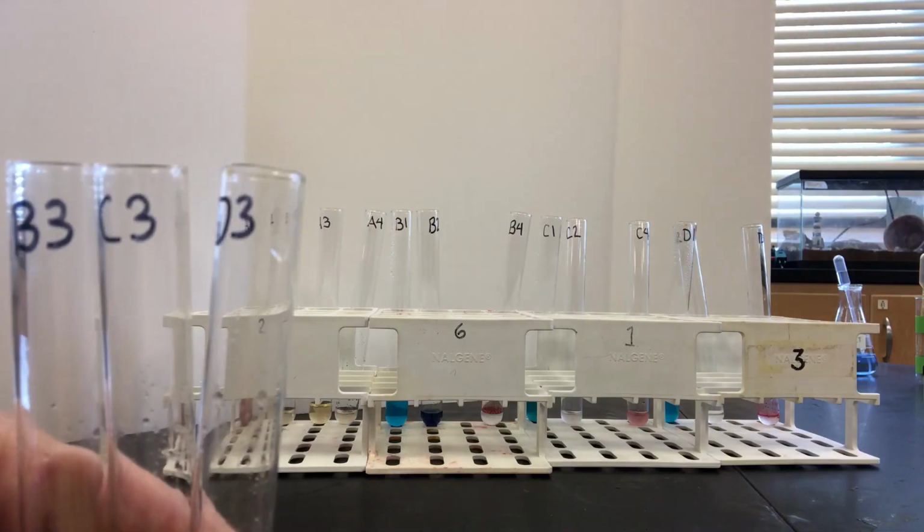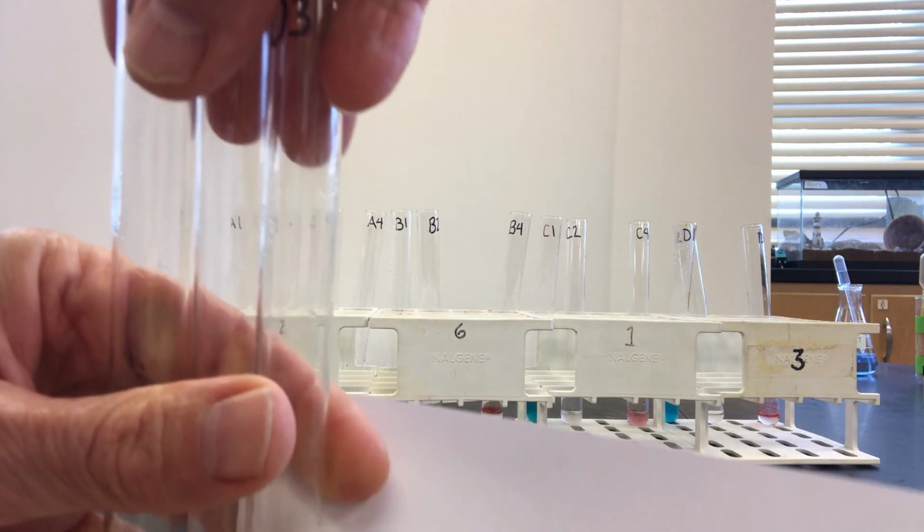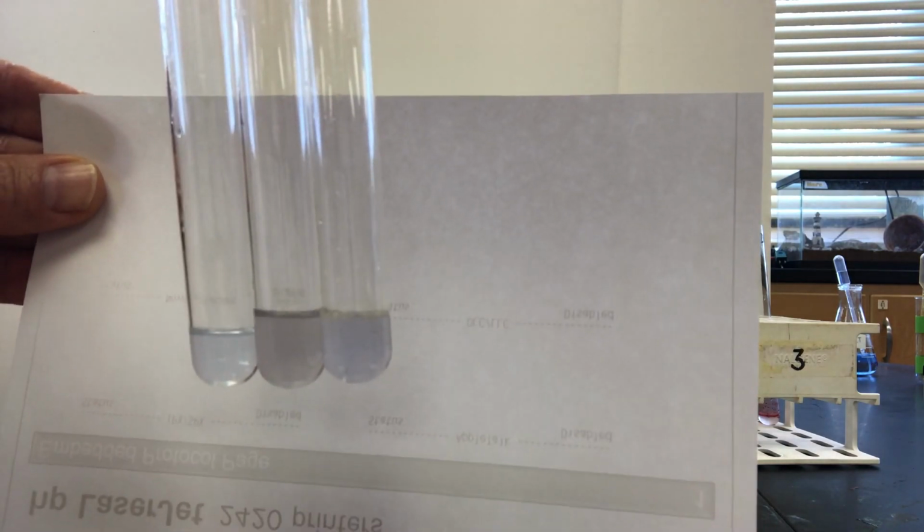You're looking for a violet or purple color, and make a careful comparison between B3, C3, and D3 for the presence or absence of a purplish color, comparing one to the other.